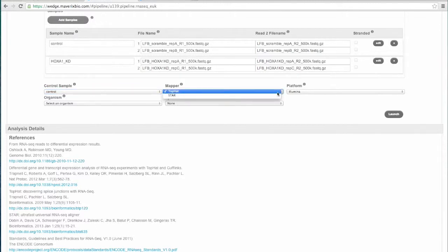The next thing you need to select is which de novo splice aligner you want to use. So for this mapper selection, we offer the option of picking Top Hat or Star. Top Hat is widely used, highly cited, sort of the gold standard for this type of analysis. Star is a really good tool as well, and in fact, running Star allows you to cut down the overall analysis time because these reads will map much faster. So you could cut your analysis in half by using Star. But we offer this option so that as a user you have a choice for this pre-configured analysis to pick between either one.